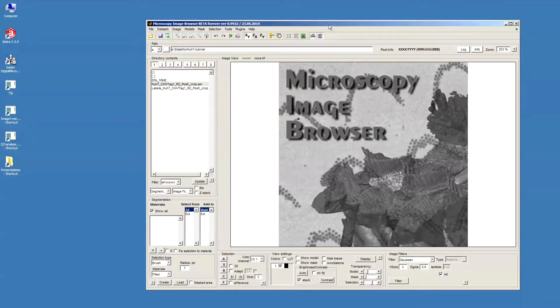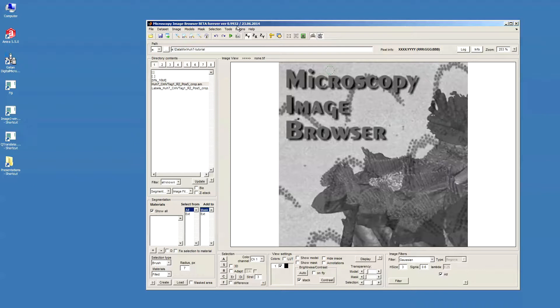Hello. This is the second part of the segmentation tutorial with Microscopy Image Browser. In the second part, we will continue segmentation of a dataset from Serial Block-Face Scanning Electron Microscopy, and this time we will try to segment nuclear envelope.